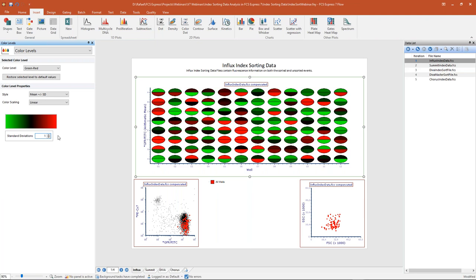I'm going to pick one for my standard deviation, and now we see the heat map updates with these nice color levels, giving a much better spread of visual representation. The upper half corresponds to my GFP arithmetic mean and the lower half to that PE size 7 arithmetic mean. Remember, with overlays we could add up to five slices or files to the wells of our heat map — we're not limited to the two parameters and statistics we've selected.